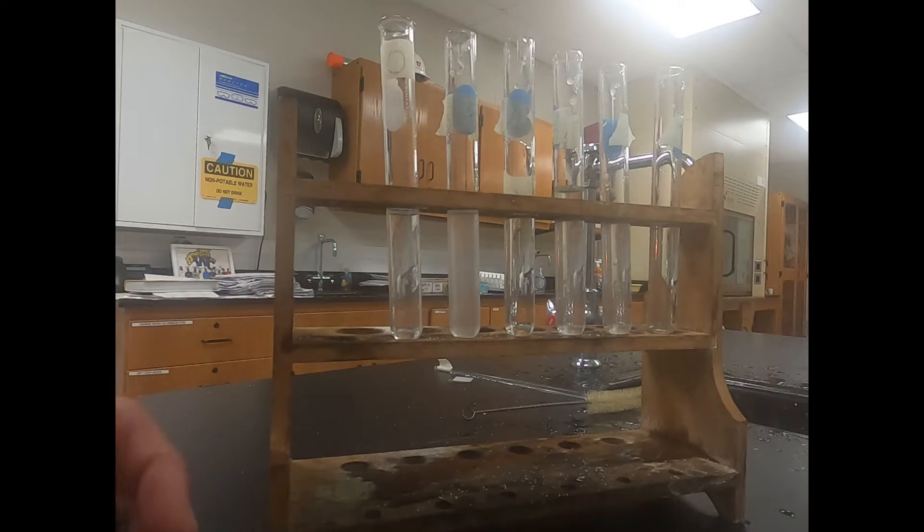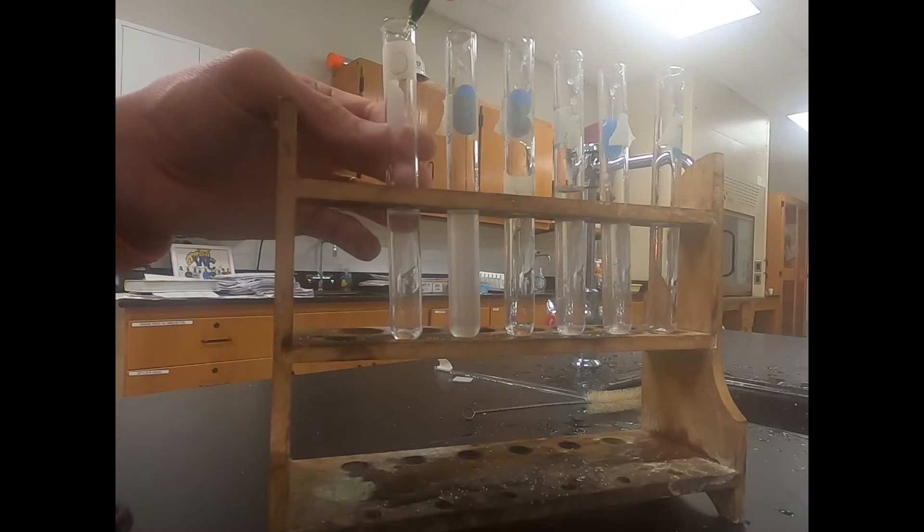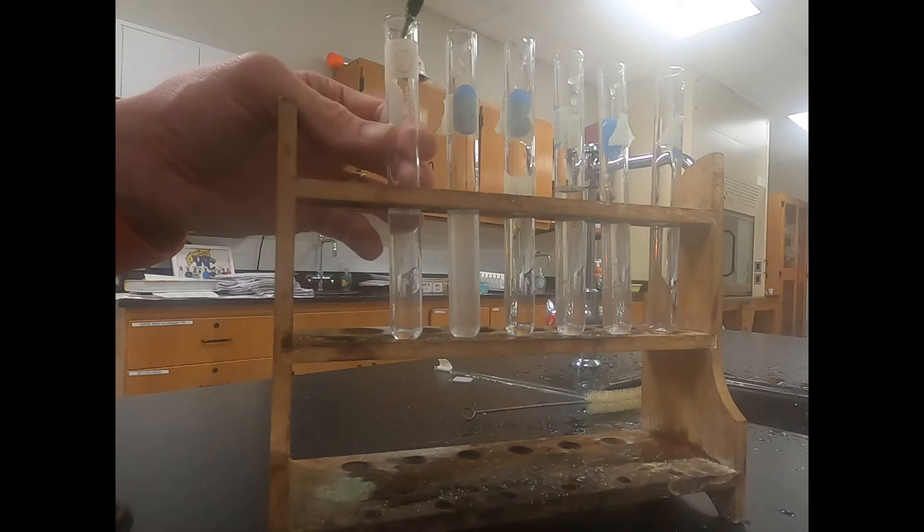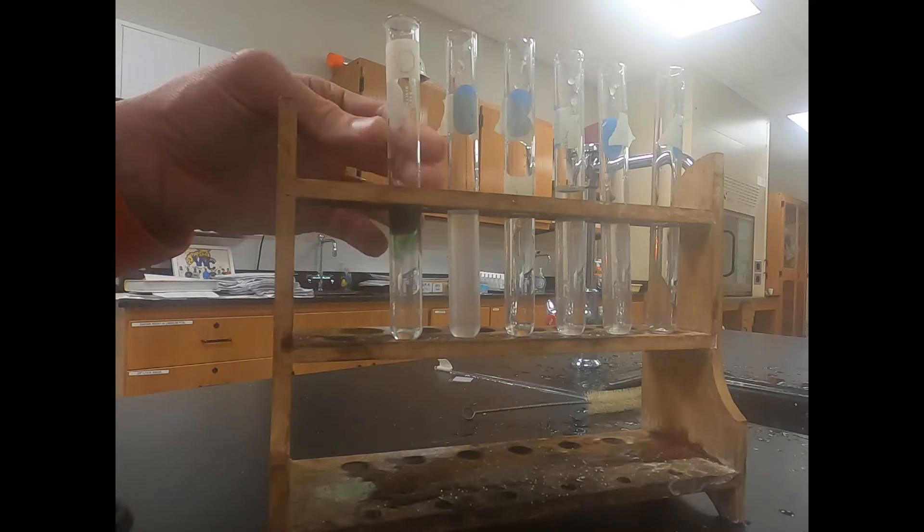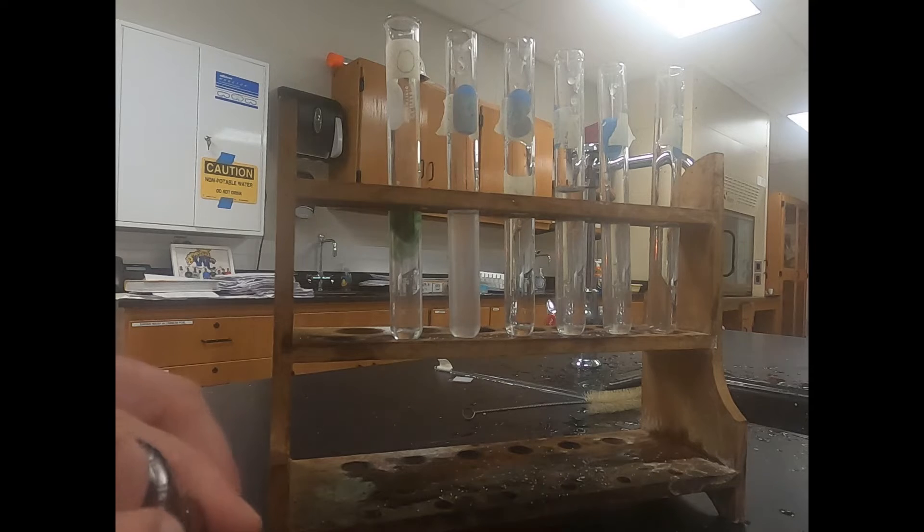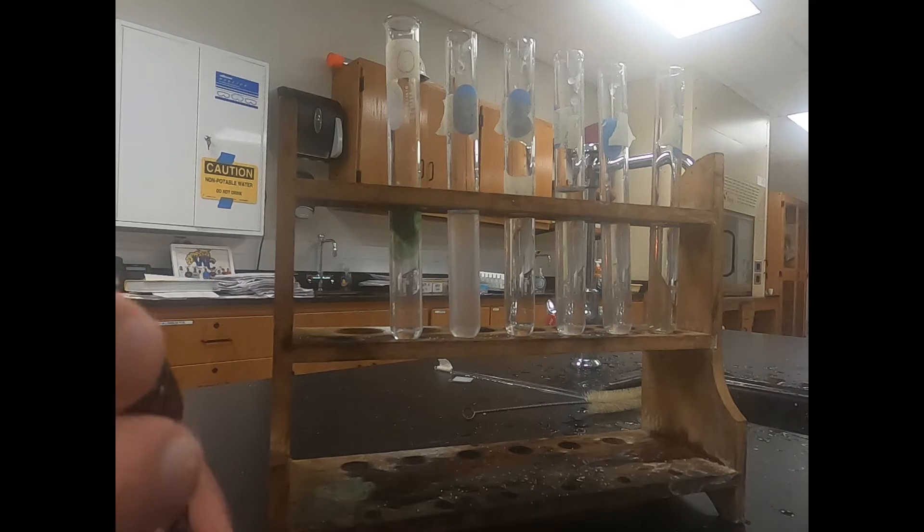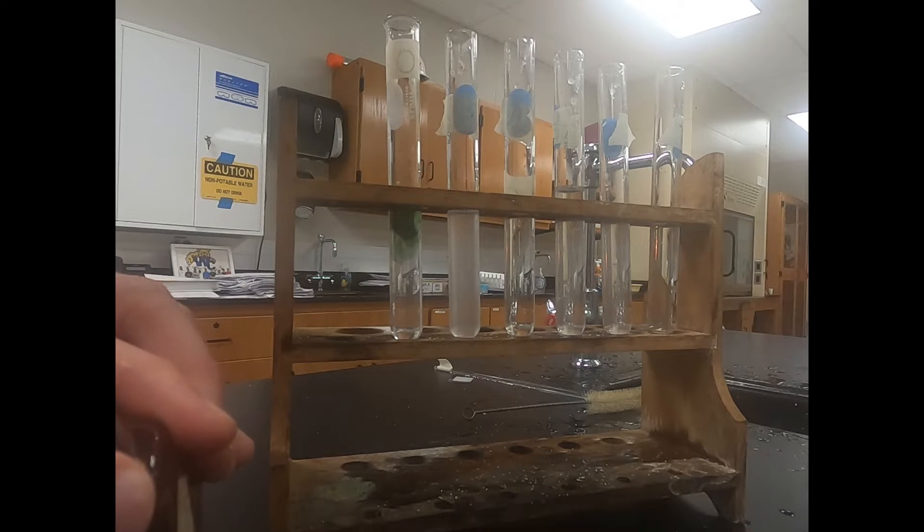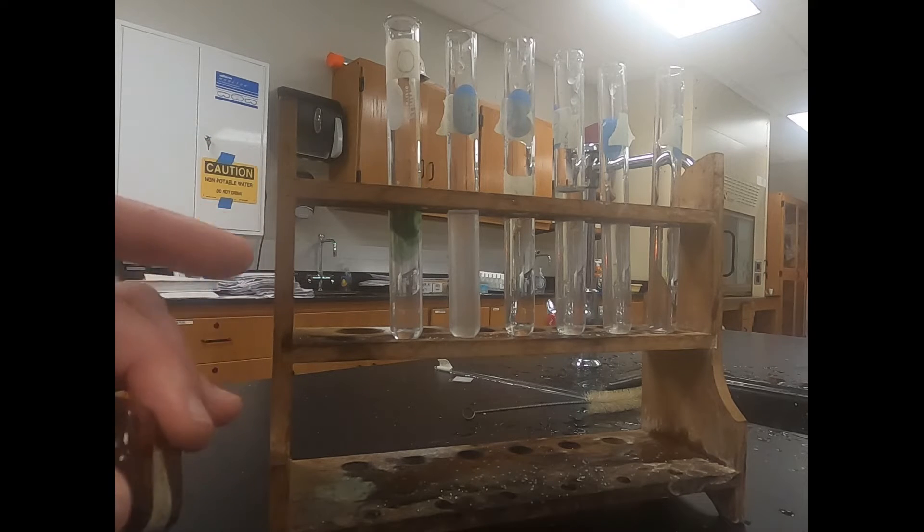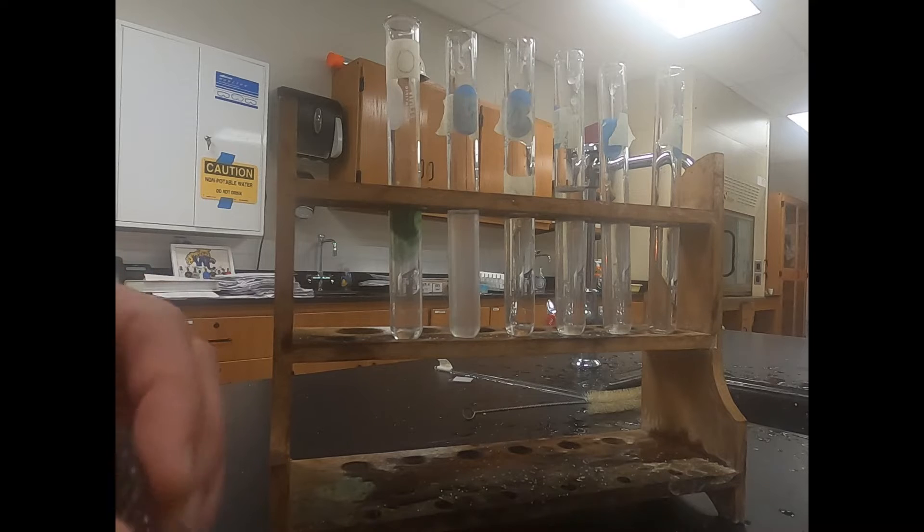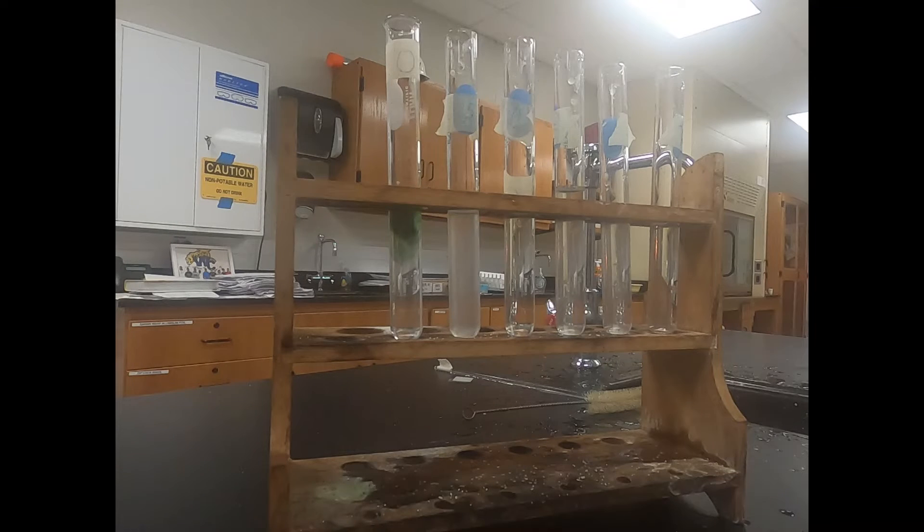Bromethyl blue is an indicator. In the presence of carbon dioxide it's going to turn to a yellow appearance. As the concentration of carbon dioxide increases it's going to become a stronger or darker yellow. It's a gradual change as the pH of the water changes. We'll add that to each one of our test tubes.